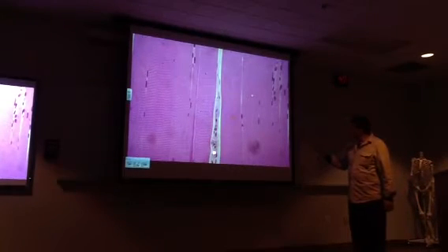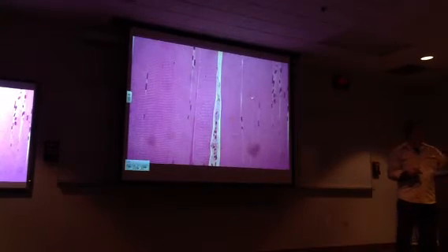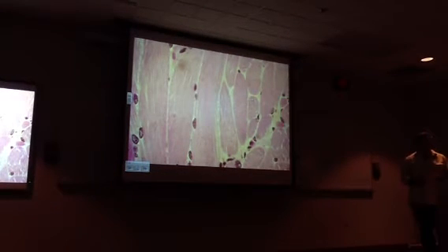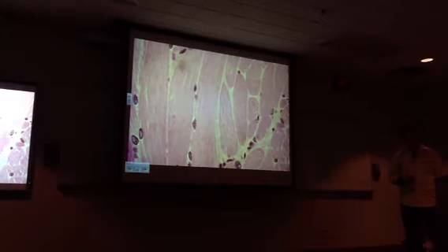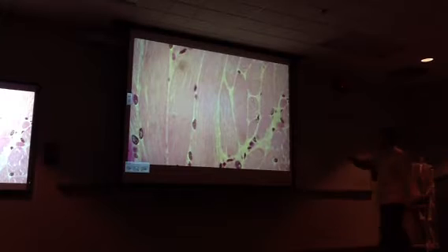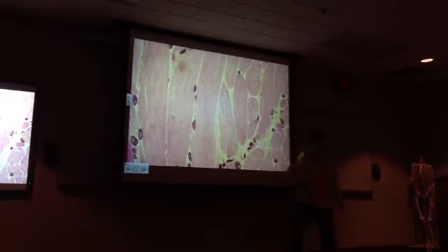Capillary or a small blood vessel, probably a little bit larger than a capillary, but not much larger than a little arteriole or venule. Skeletal muscle. Again, you can get a sense of the myofibrils, each one of these being many, many myofilament molecules, and you can get a sense of them when you see them in cross-section as well. And nice peripheral nuclei, looking like this around each of the individual cells.